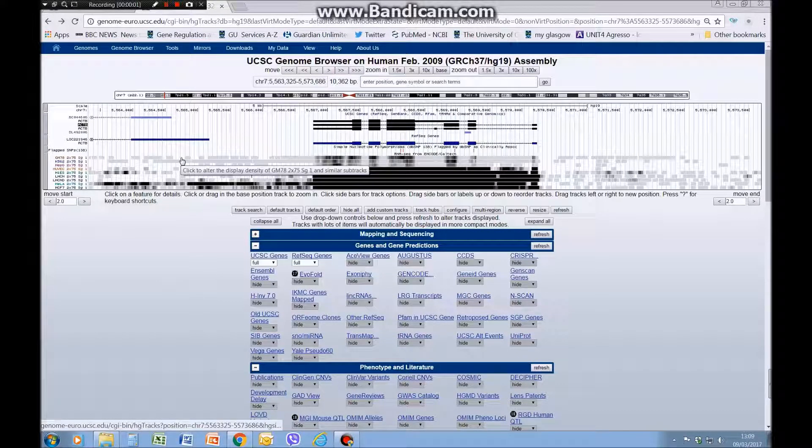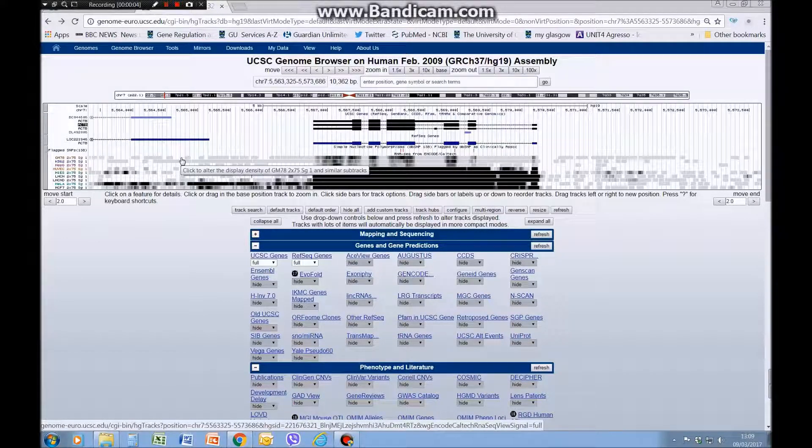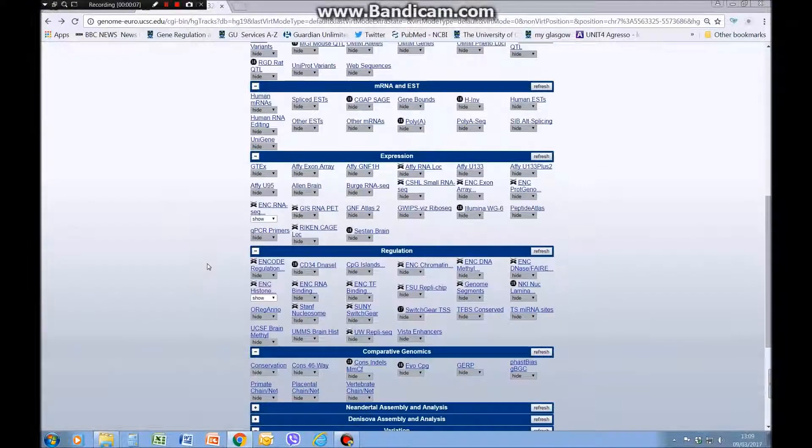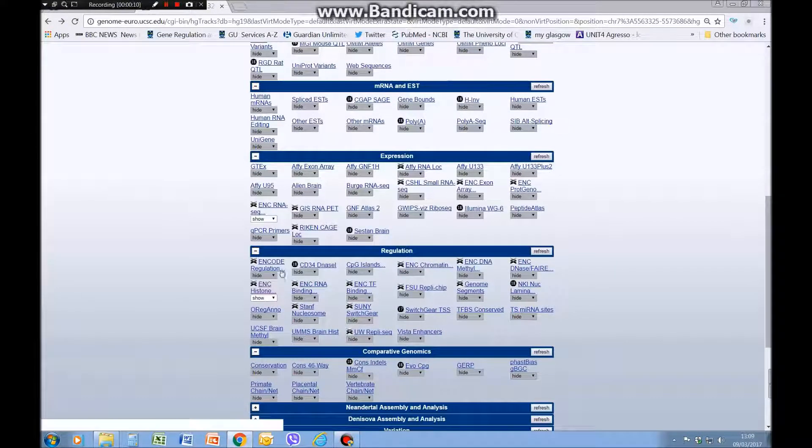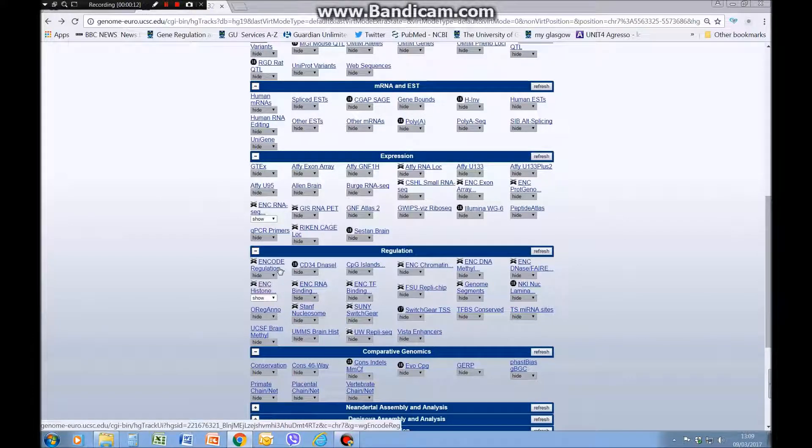In this last video I'm going to show you how to view histone modifications and chromatin state maps. We're going to scroll down to the regulation section and first look at this ENCODE regulation.